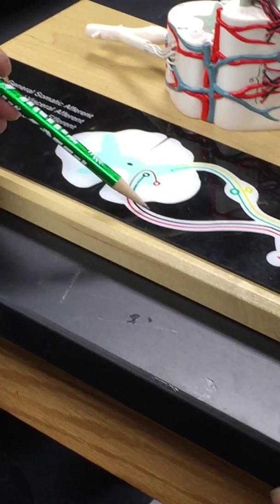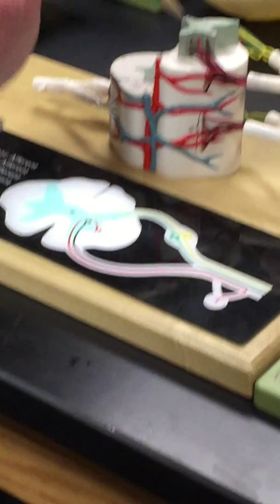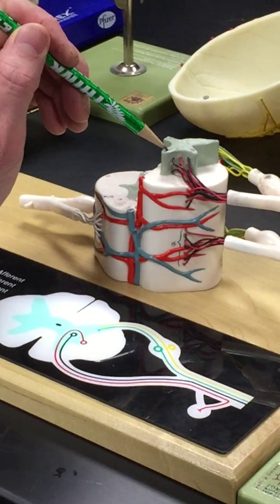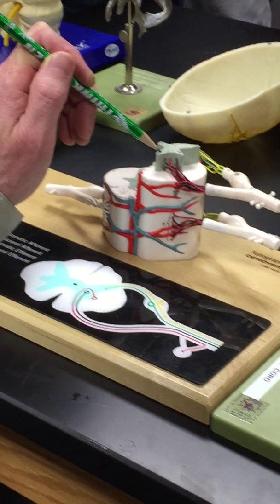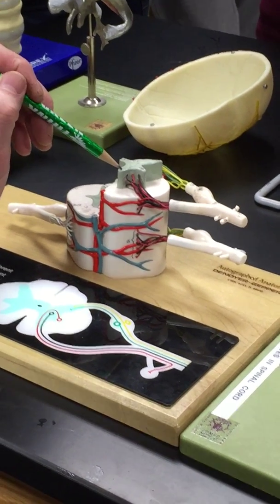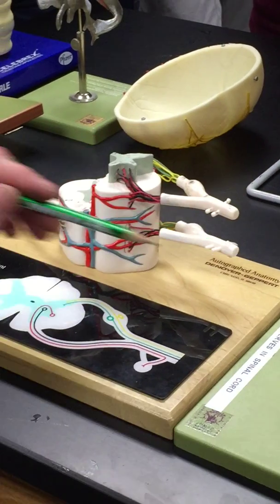This is the cell body of what kind of neuron? What kind of neurons would have cell bodies right here? Specifically, well, motor is efferent. Those are interchangeable terms. Somatic, implying these are going to be the neurons that supply skeletal muscle.